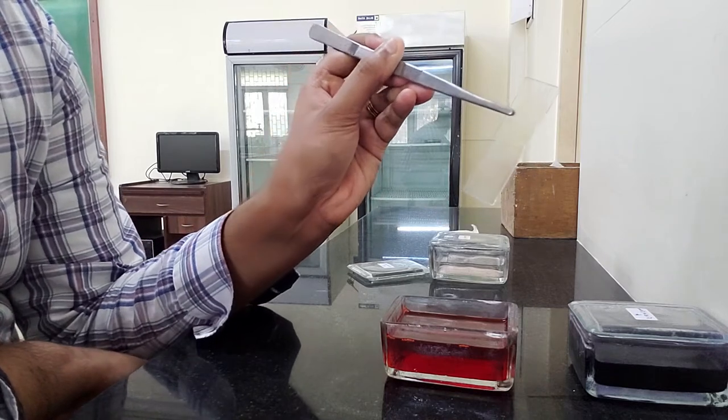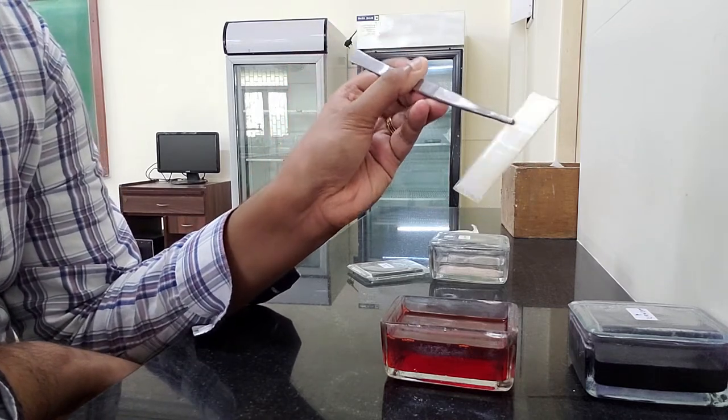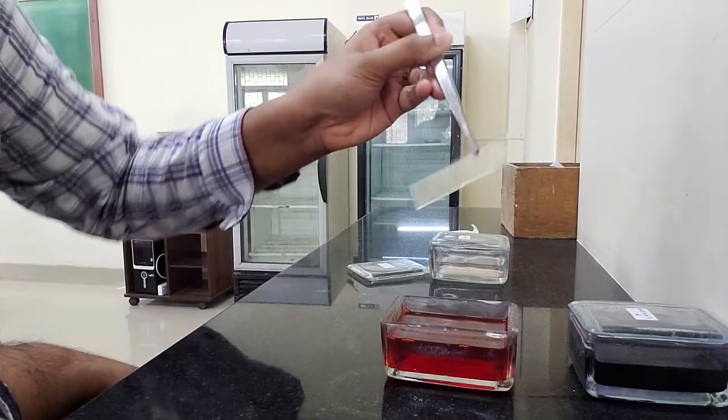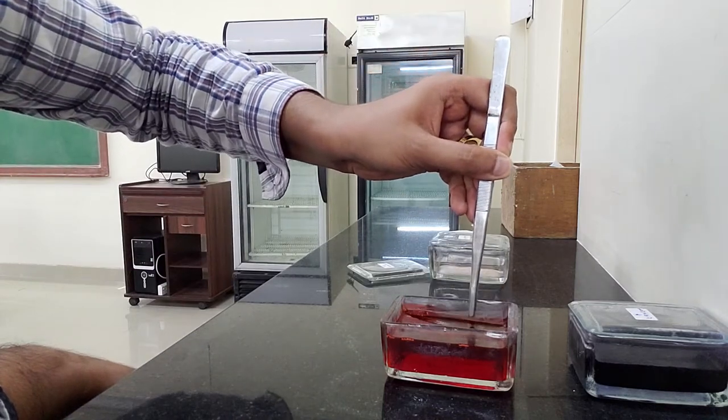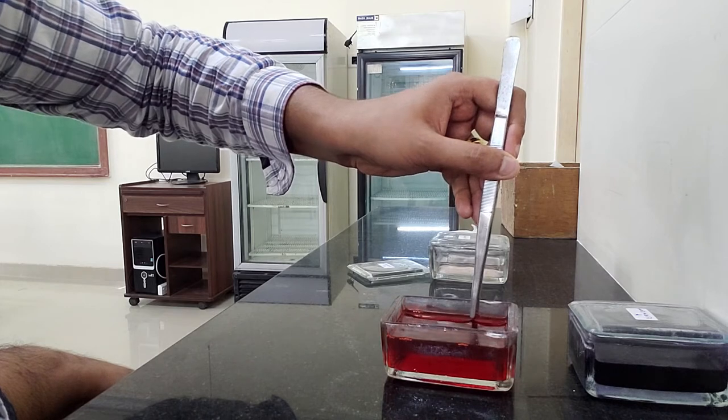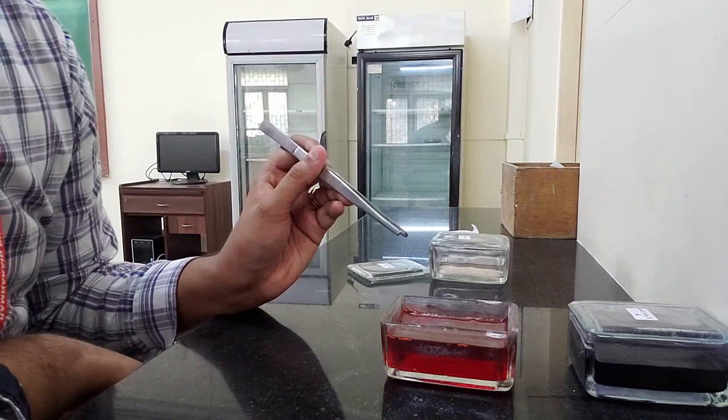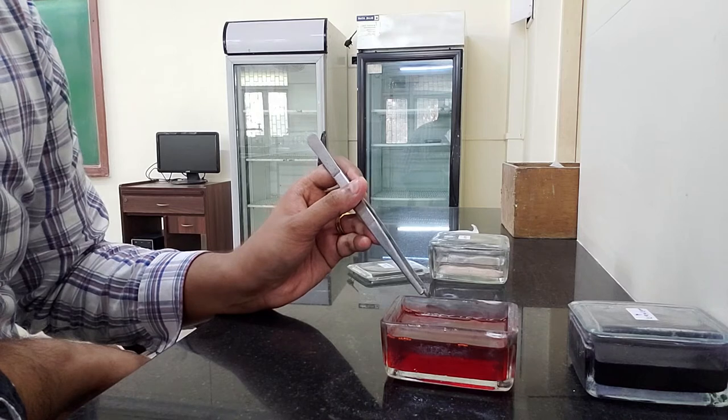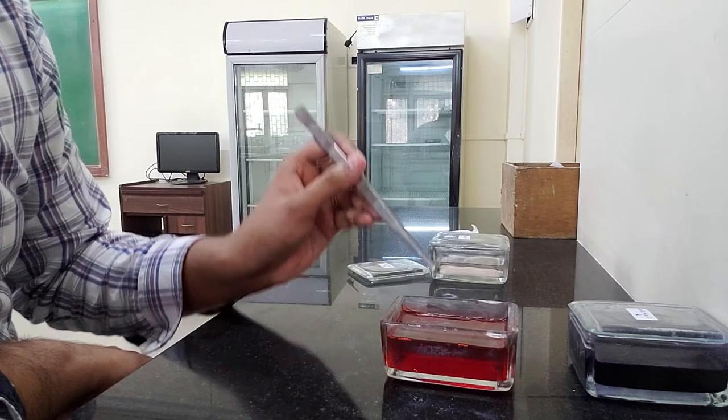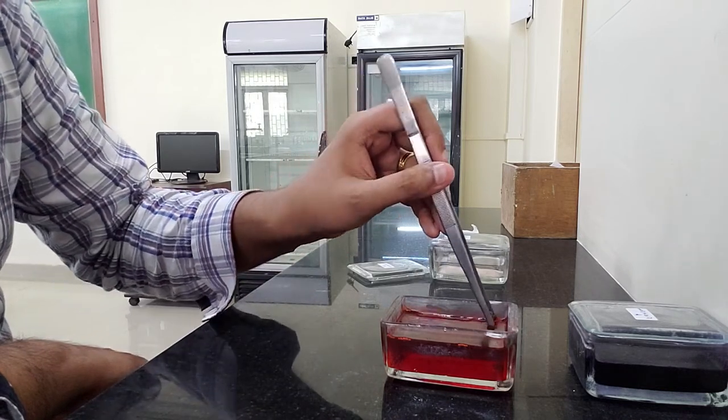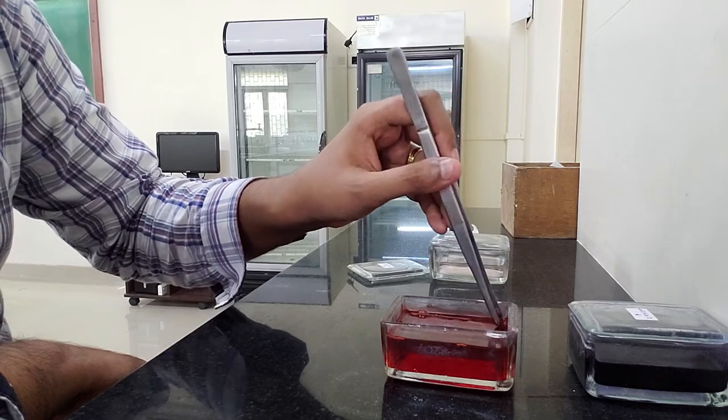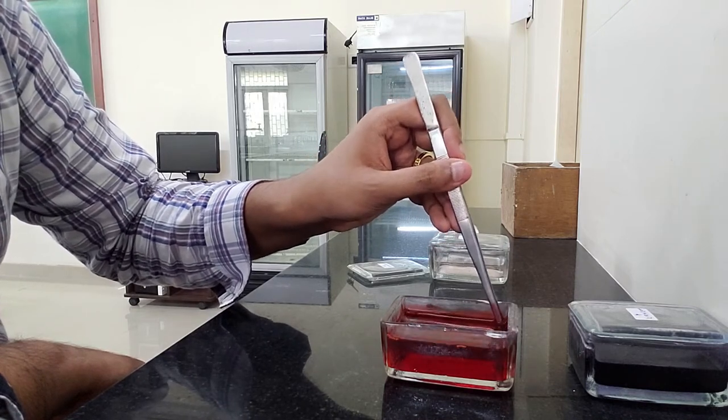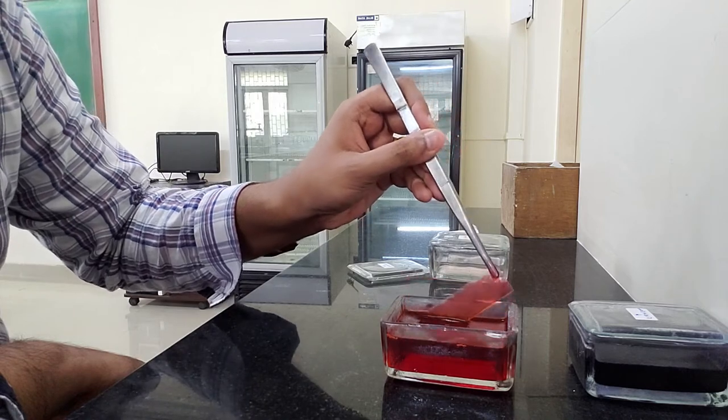Now that my slide is completely dry and all remnants of methanol has evaporated, you have to use a forcep and gently dip it into the Field stain B. You have to count five seconds. The moment five seconds is done, gently using the forcep see to it that you remove your slide.